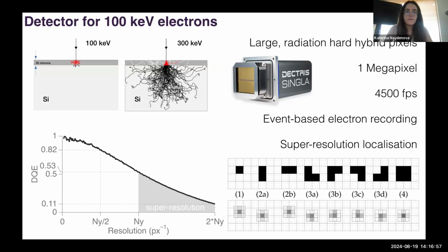So the way we worked around this previously, when the detectors for 300 keV were designed, we made back-thinned detectors, so that the piece of detector material, the silicon, is only a couple tens of microns thick, and the electron trajectories do not have a chance to spread out too much, but the electrons still deposit some energy, and you're just detecting in this little red triangle.